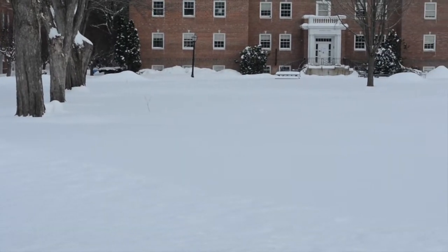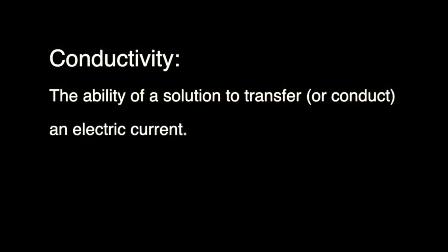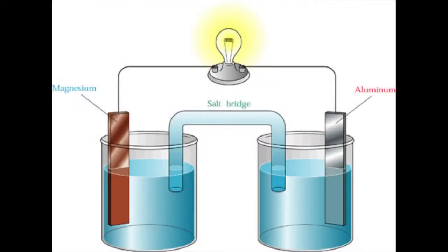The purpose of this project is to reveal the conductivity of snow. Conductivity is the ability of a solution to transfer or conduct electric current. Conductivity will determine the unknown ion concentrations of the snow samples. The unit of measurement that will be used is microsiemens per centimeter.